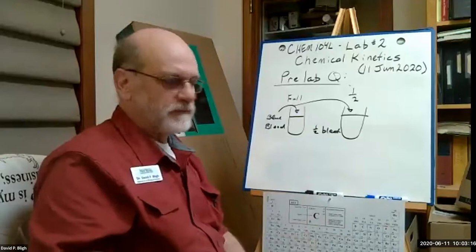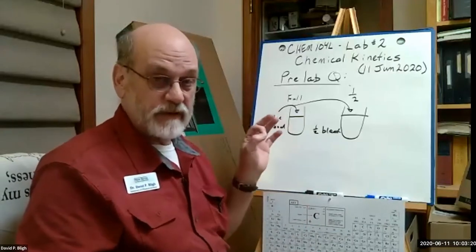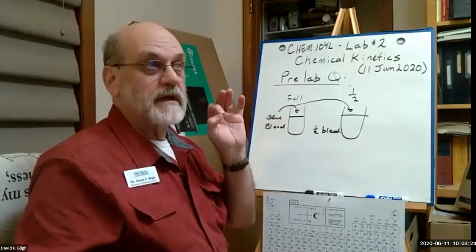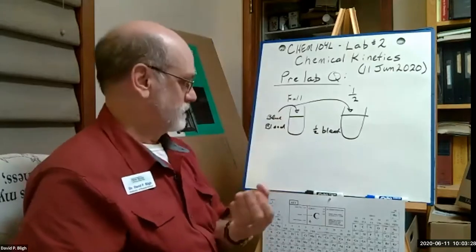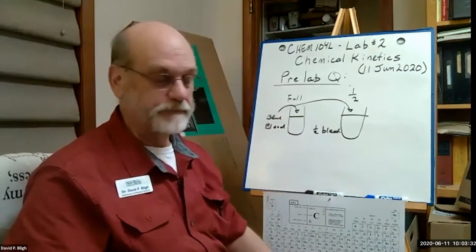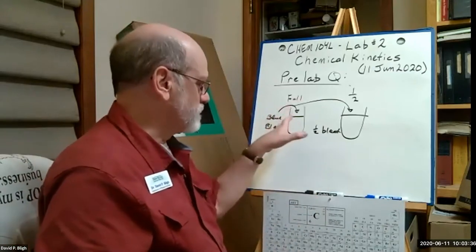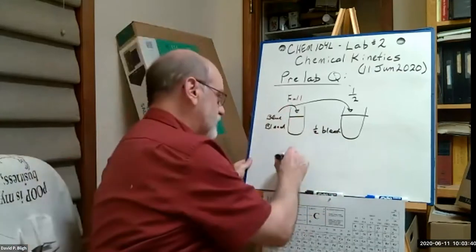The problem is your reaction environment is very sensitive to the ionic strength. Right? How many ions do you have in solution? So at this concentration of bleach, you can assume that it is completely dissociated.